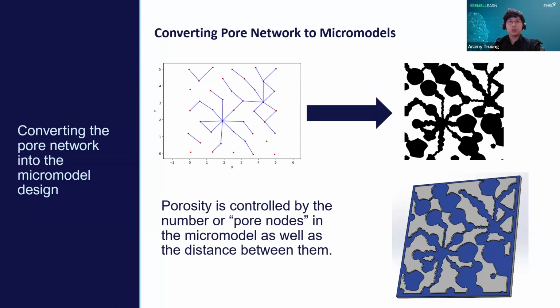You could adjust the pore shapes if you want. In this image, they are randomized blobs, but you can also change them to be circles. And one thing I want you to notice is that a lot of the throats, they're not straight lines. So they're not like cylinders, like when we extracted them. There are features of pore2chip that allow you to change the tortuosity of the pore throat, or the general waviness of the pore throat. And you can adjust this too. It'll be a random amount. If you wanted straight throats, you can change the tortuosity factor to 0 if you'd like.